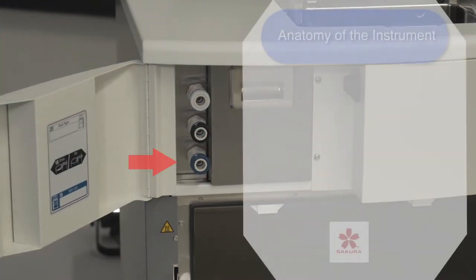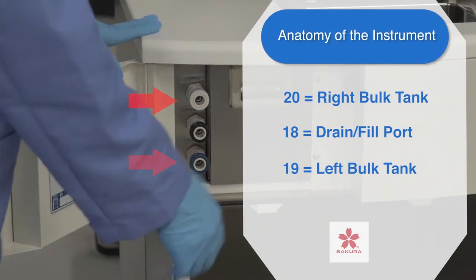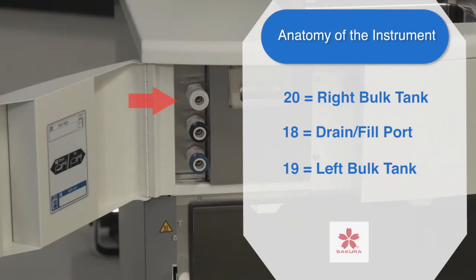The port for station 19 fills the left bulk tank and station 20 port fills the right bulk tank. These two connections only fill. Station 18 port, the middle port, is the workhorse of this processor and it fills and drains all the reagent containers as well as drains the two bulk tanks.